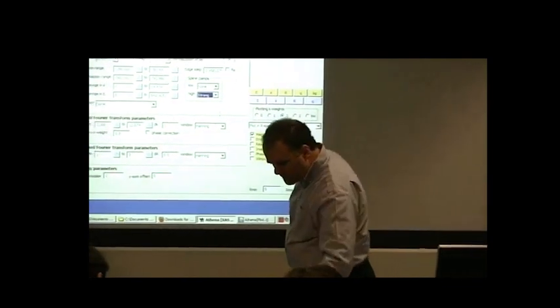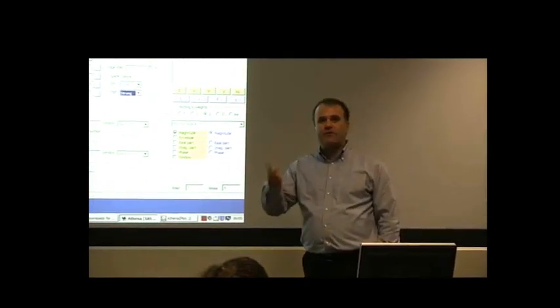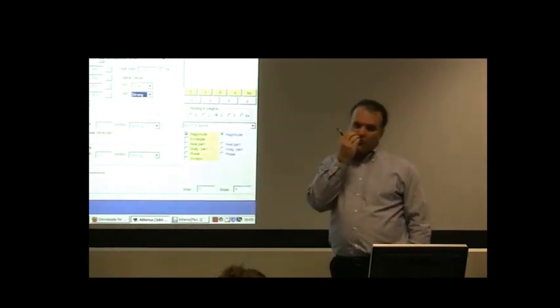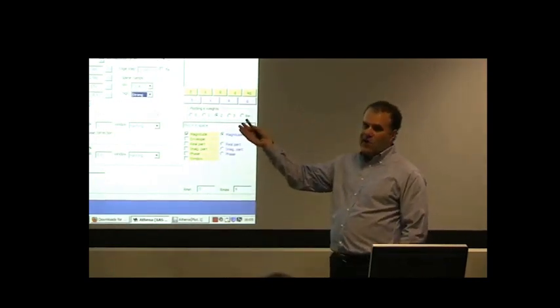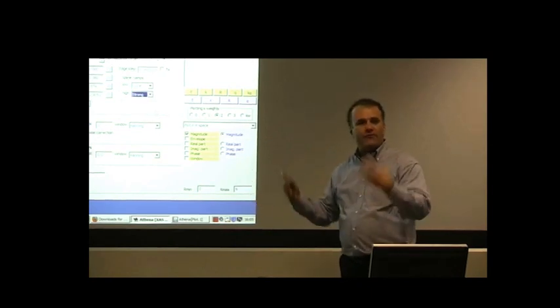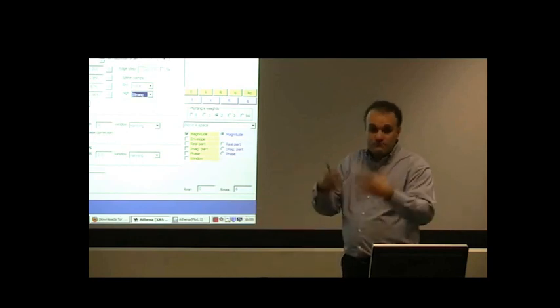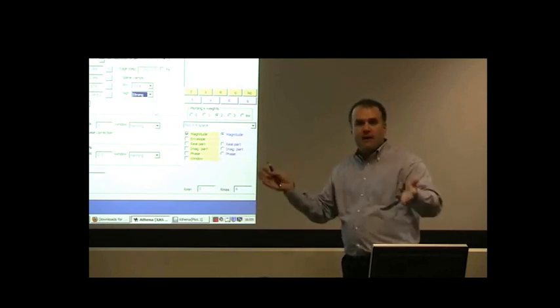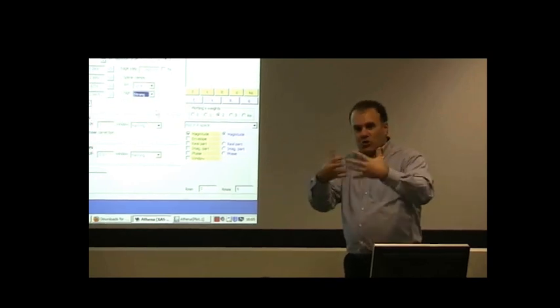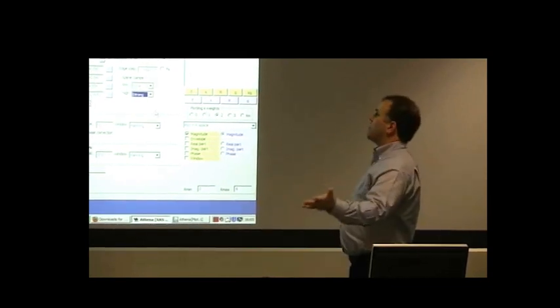E naught is also the zero of k, the point of the zero of k for when you transform to chi of k. Right? When we go from energy to chi of k, we're not only doing the background subtraction, but we're changing the x-axis from energy to photoelectron wave number, which are related. Energy above the edge is proportional to the square of the photoelectron wave number, so we do that conversion of the x-axis. But we have to have a zero of energy, a zero of k.